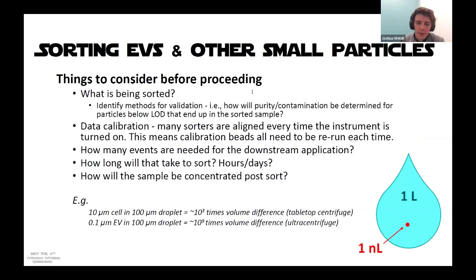Yes. And then sorting. Joanne, you want to take this subject? We've just been getting a lot of questions about sorting. I think that's the natural progression of the field, where people are like, hey, we're seeing these particles now and we want to sort them. But there are a lot of caveats. So I don't know, Josh, you want to start? You've actually done EV sorting. You were part of that crew sitting there.